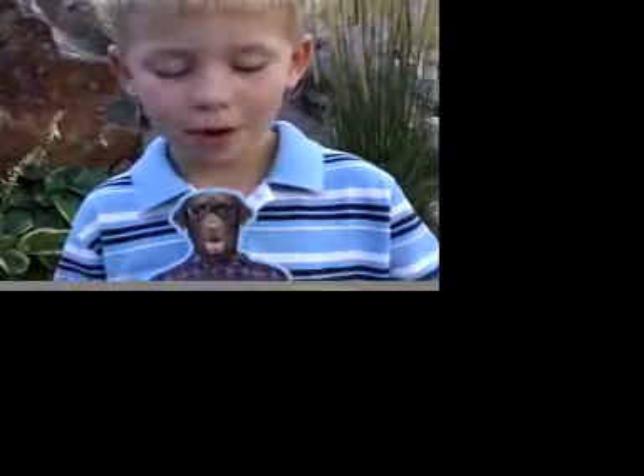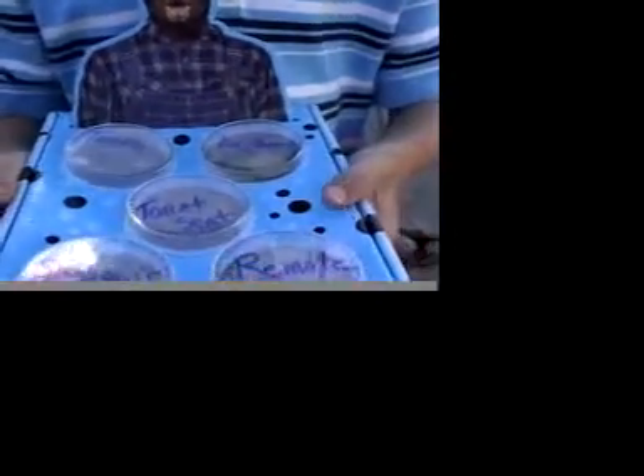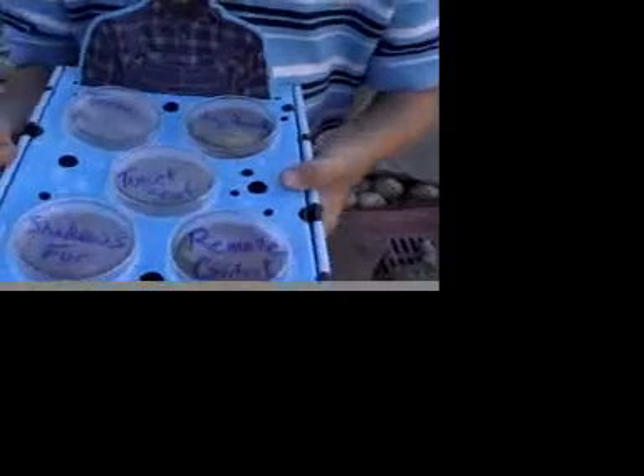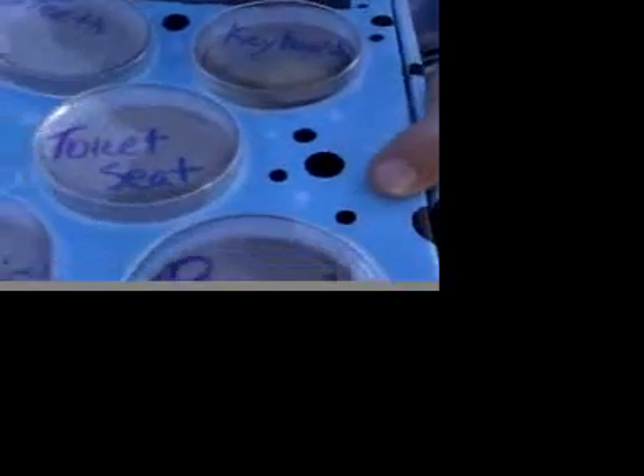Hi, and I'm Jack, and what I want to start with is, I want to show you my bacteria farm. I wanted to test some things and see if they were dirty, so I just did my teeth, the keyboard, and the toilet seat.